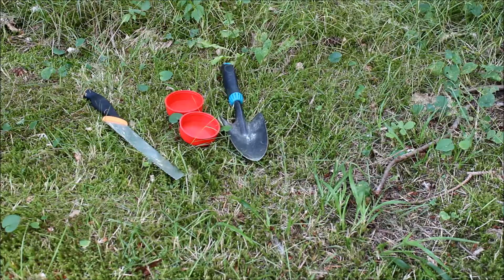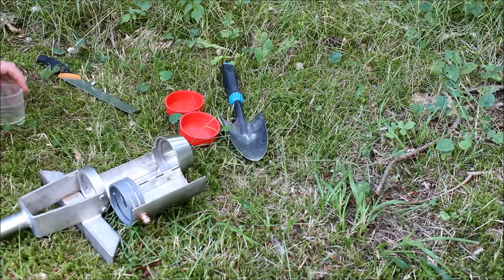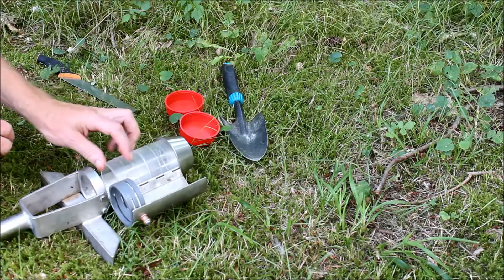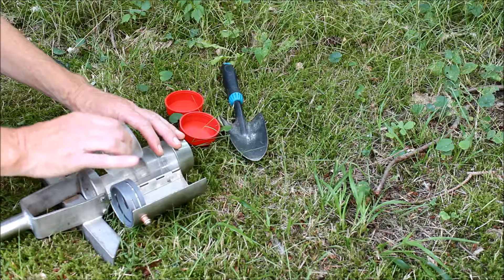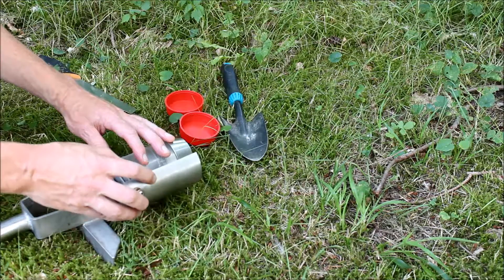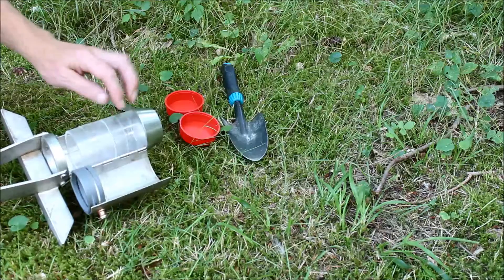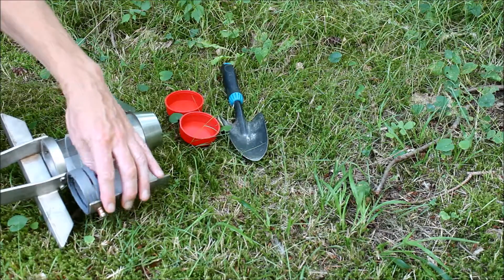First, I will take the soil corer and put in two plexiglass rings. The rings are cylinders. The second one may not be used, actually, but with the kind of soil corer or auger that we use, it will support the first one so it won't move up into the corer while taking the sample.